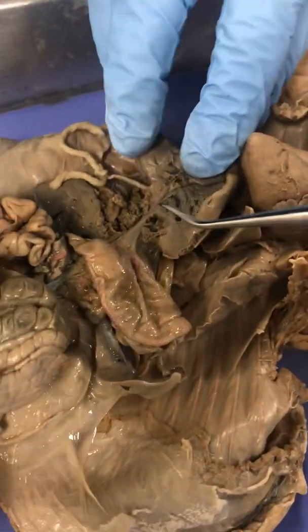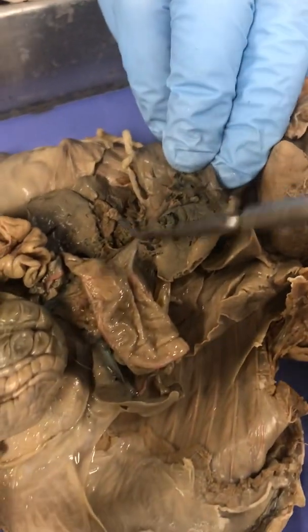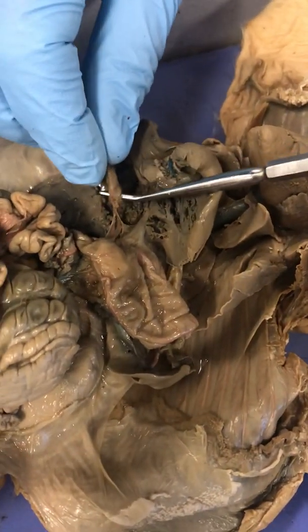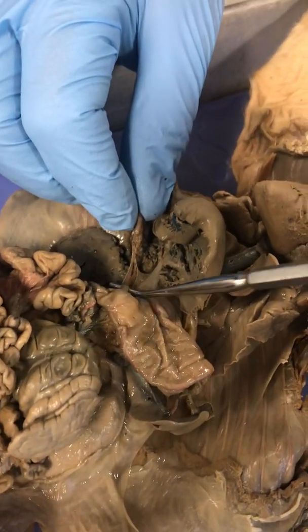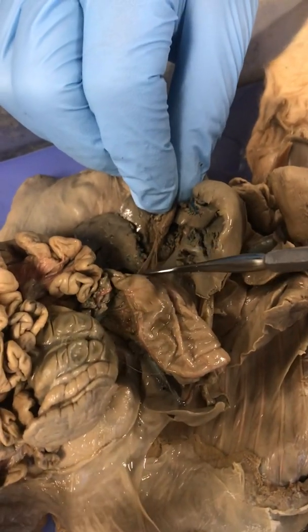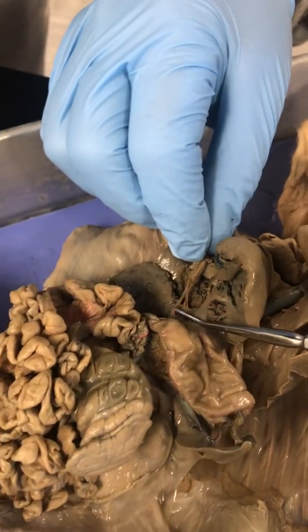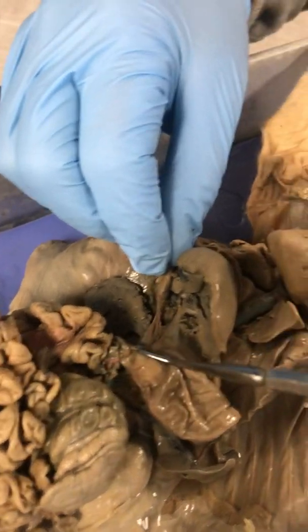Is that the hepatic portal? Yeah, and if I can find it, right there. There's the gallbladder. There's the cystic duct. And if you can follow it down, and I must admit, I'm having a hard time seeing it right there, but there should be a tube, the common bile duct, that will convey bile down into the duodenum.